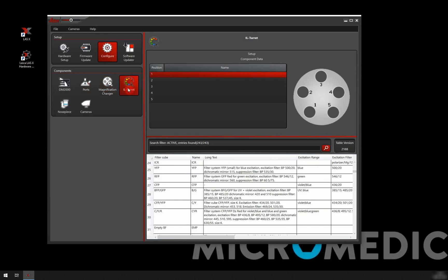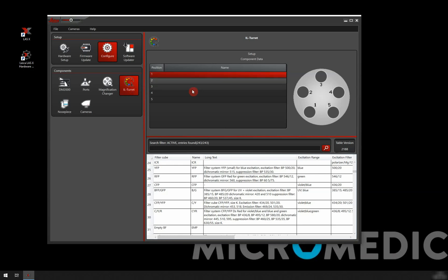Incident light turret is also something that always comes up. Very often with these more basic upright microscopes, you might not have one. Again, then you don't really need to do anything. But if you do have, for example, fluorescence on your microscope, you would add your filter cubes here.